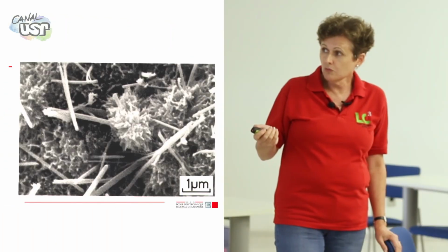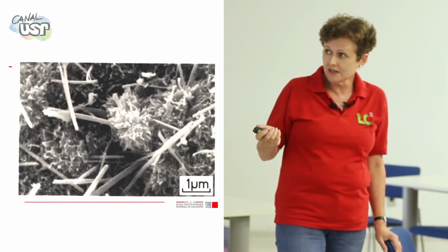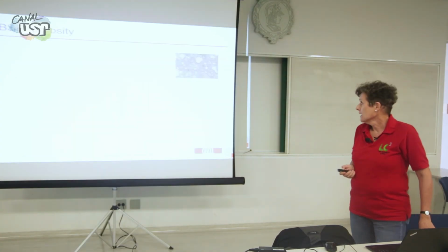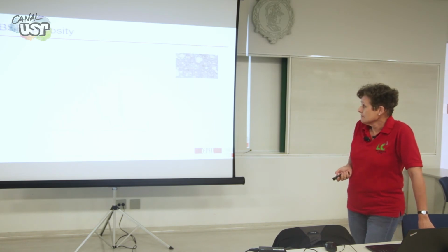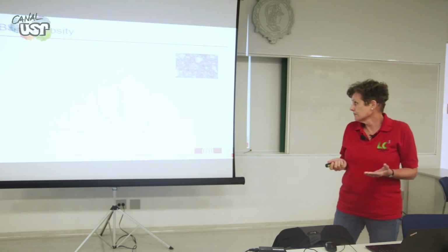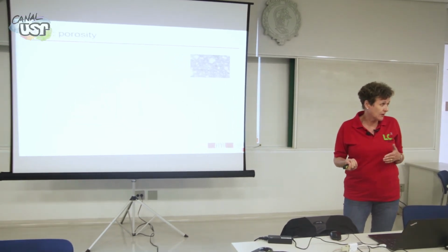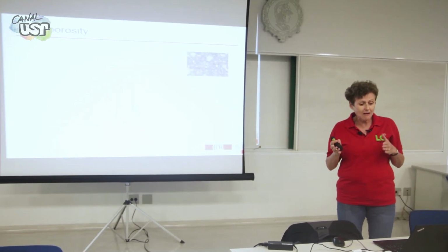Most of the porosity is now between these needles in a well-cured paste. Well, that's of the order of 10 nanometers. So if you want a comparison, you can threshold porosity and compare one sample with another. If you want to do it for comparison purposes, it's okay, but don't think it's the real absolute porosity.